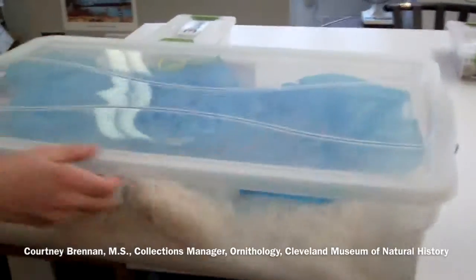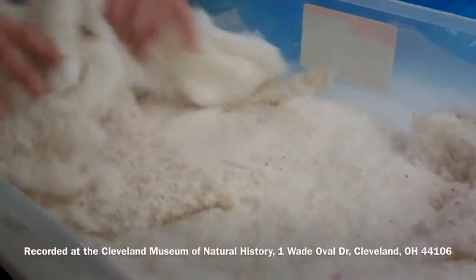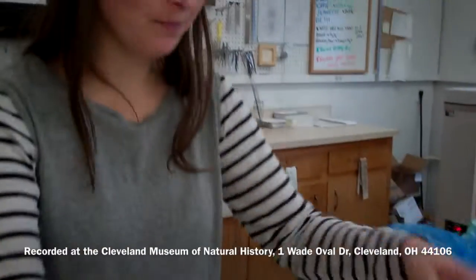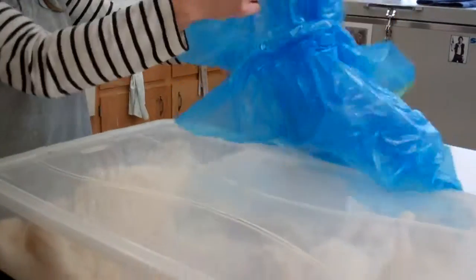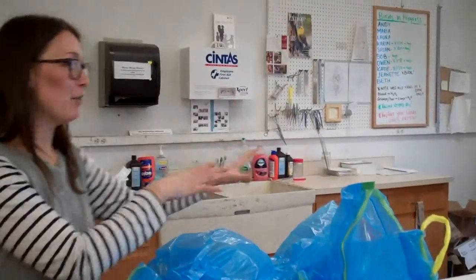All of our birds get placed gently into these giant tubs, and then we cover them with cotton. We double bag each tub by putting one garbage bag over it, then another one, and then they hang in the freezer.